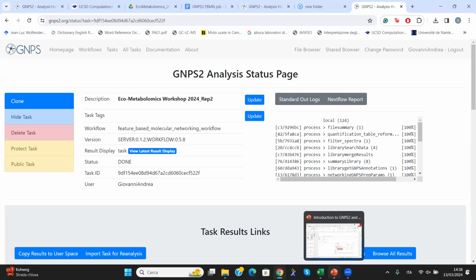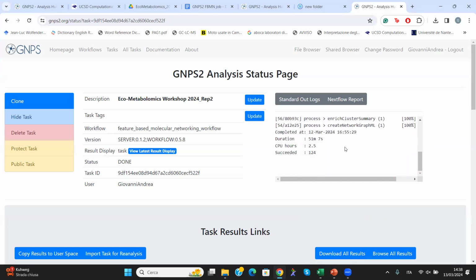Basically, if you had submitted the job and waited for about half an hour, you would have gotten an email with a link, and then you can go to this website. It's very much the same concept. You get this URL, put it in your paper, or share it with your collaborators, and then you can reproduce whatever data analysis comes out.